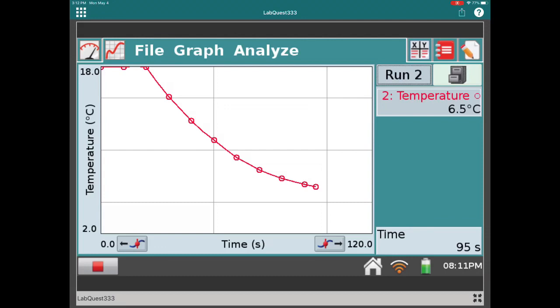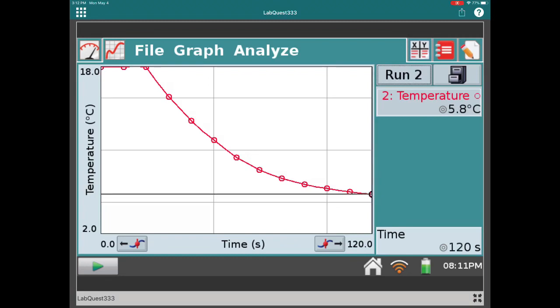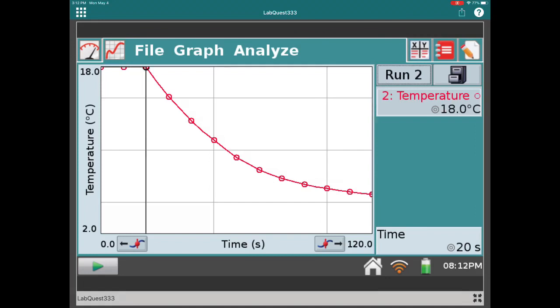There's a very nice-looking curve, starting around 18 degrees Celsius — we've got quite a dramatic drop in temperature going on here. At about 15 more seconds we'll collect the final temperature and the initial temperature so you can find delta T. Clicking on the last data point — there you go — you can see what the final temperature of the hexanes reached as it cooled, and the initial temperature when it began evaporating. Now you can find delta T.